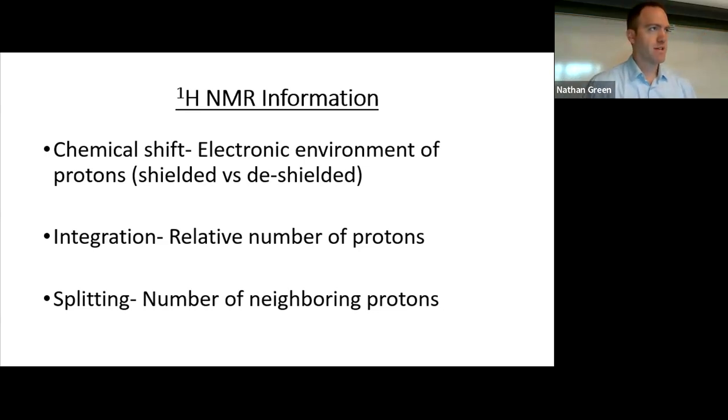As I have been mentioning for the last several days, NMR is, I think, the hardest spectroscopic technique we do, but it's also the most informative. If you brought me an unknown molecule and said, I need to know what this is, but you can only do one thing to look at it, far and away, I would use a proton NMR. Every organic chemist would use a proton NMR. If I could get a good, clean proton NMR, I can tell you the exact structure.